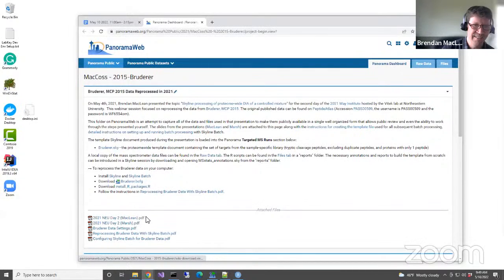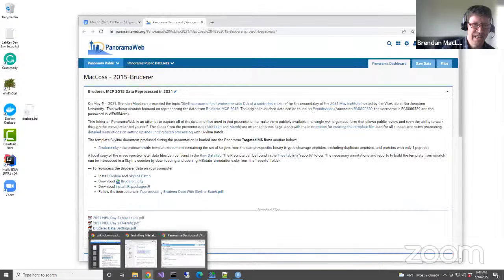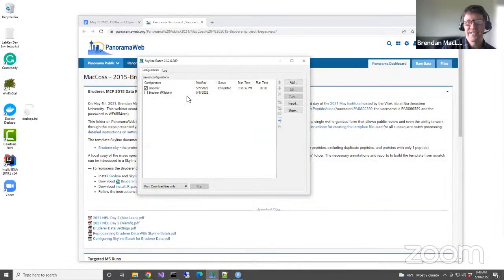You can come back here, read this stuff thoroughly, and get to the same point. We even have the slides that we presented last year, which are slightly modified, or not quite exactly what I just presented, but very similar. And then I'm going to present a set of slides that will be like Ali's when we get to actually working with Skyline Batch. We asked you to download this BCFG file, and you would end up in Skyline Batch with something like this, where there are these two configurations. One's called Bruderer and one's called Bruderer MSstats, so they're very close to each other. I'm going to show you how to create both of these yourself later. But we asked you to just run the download files only.